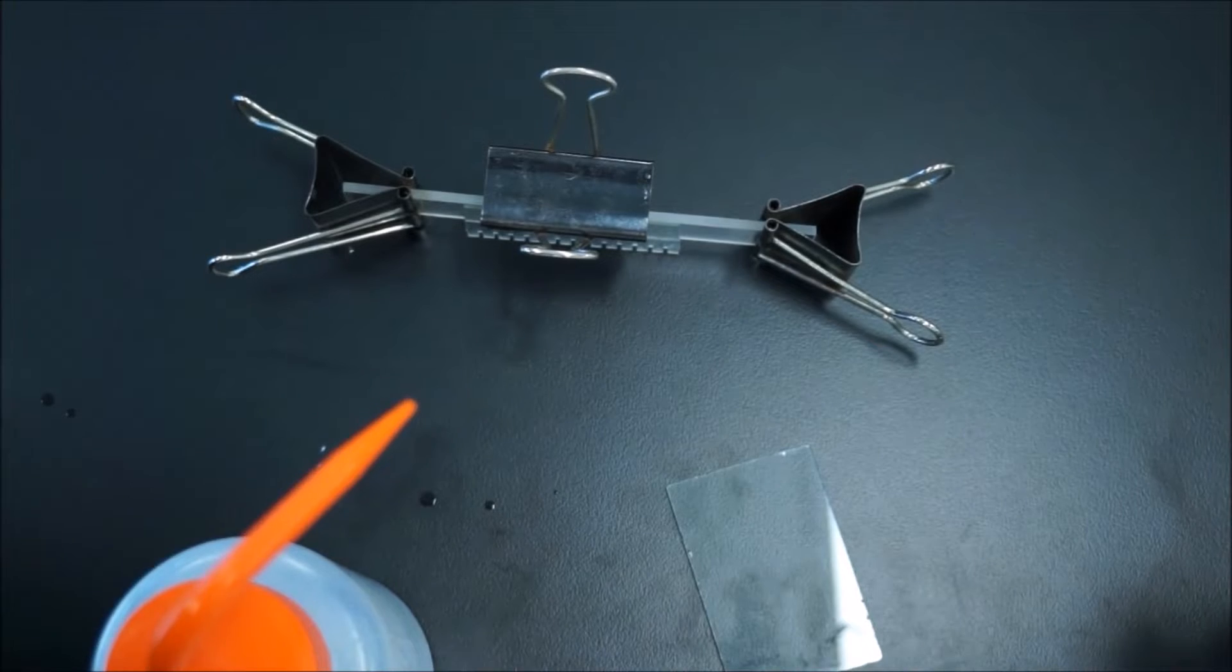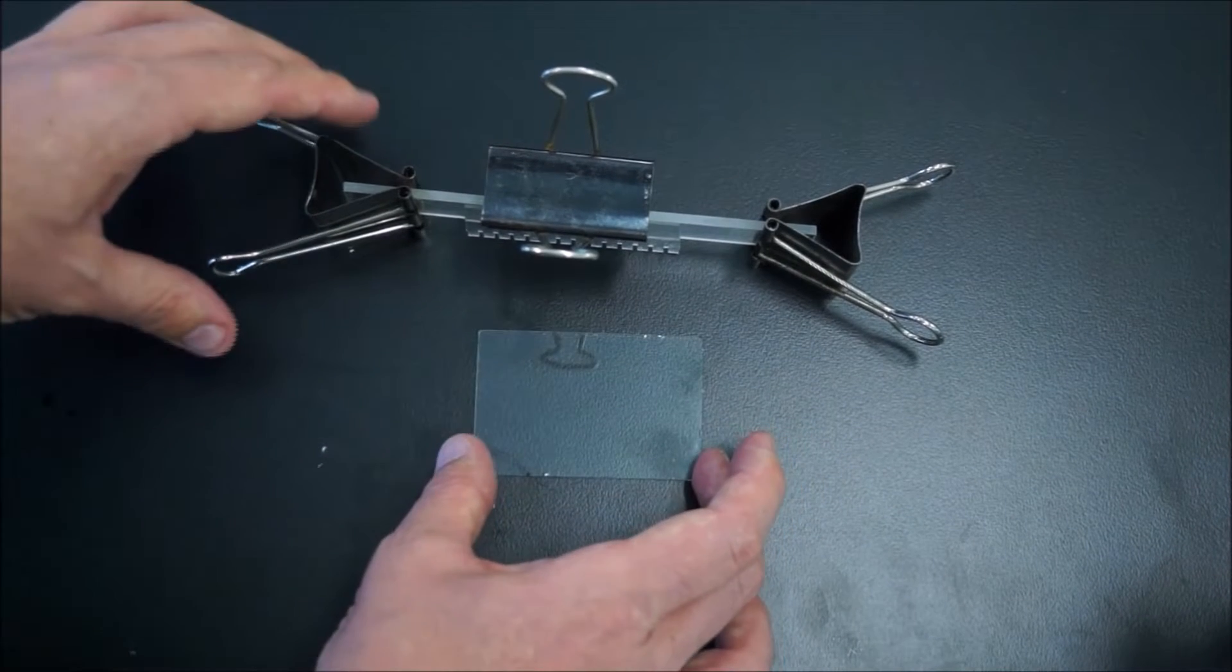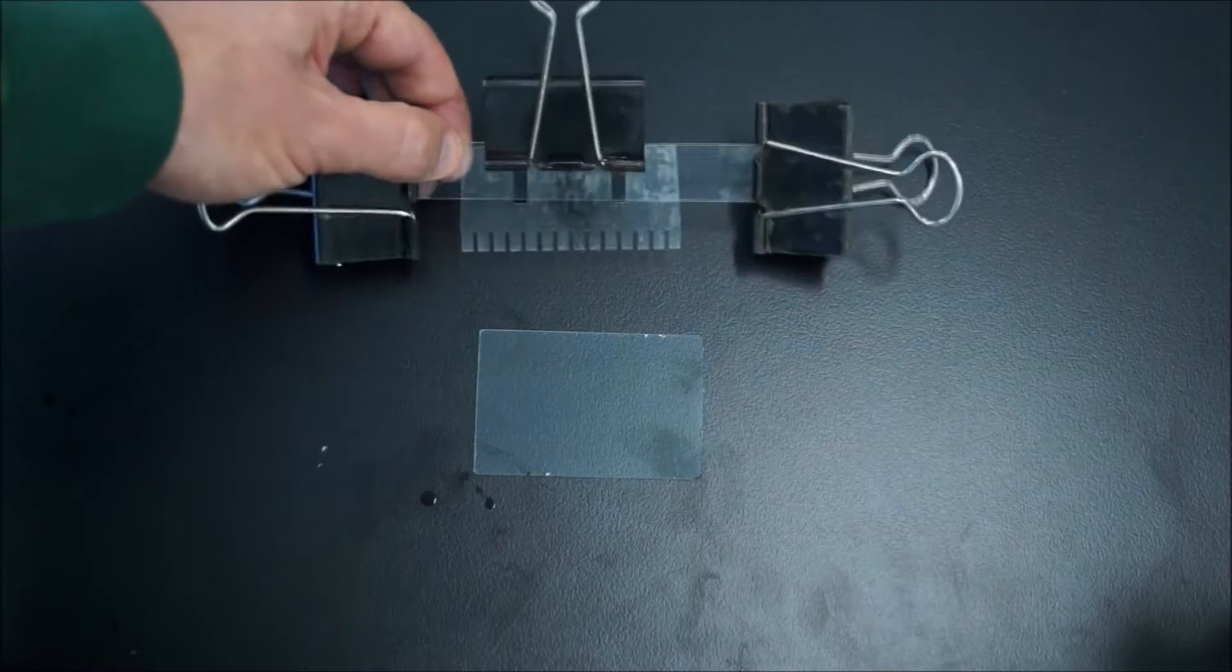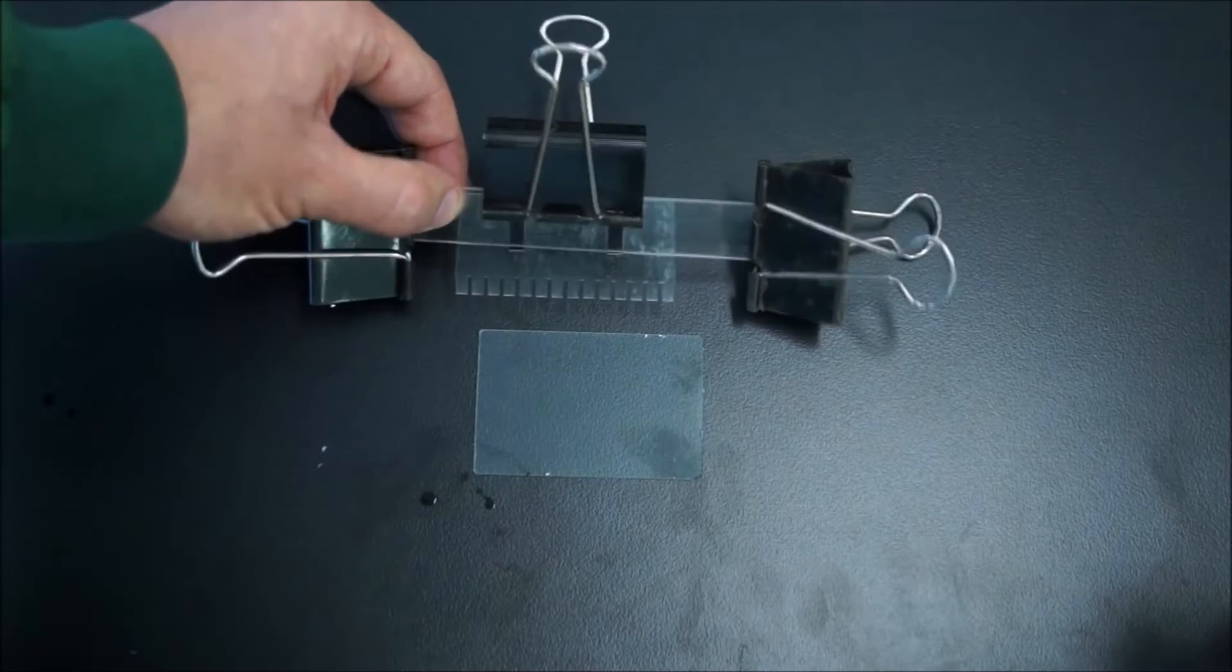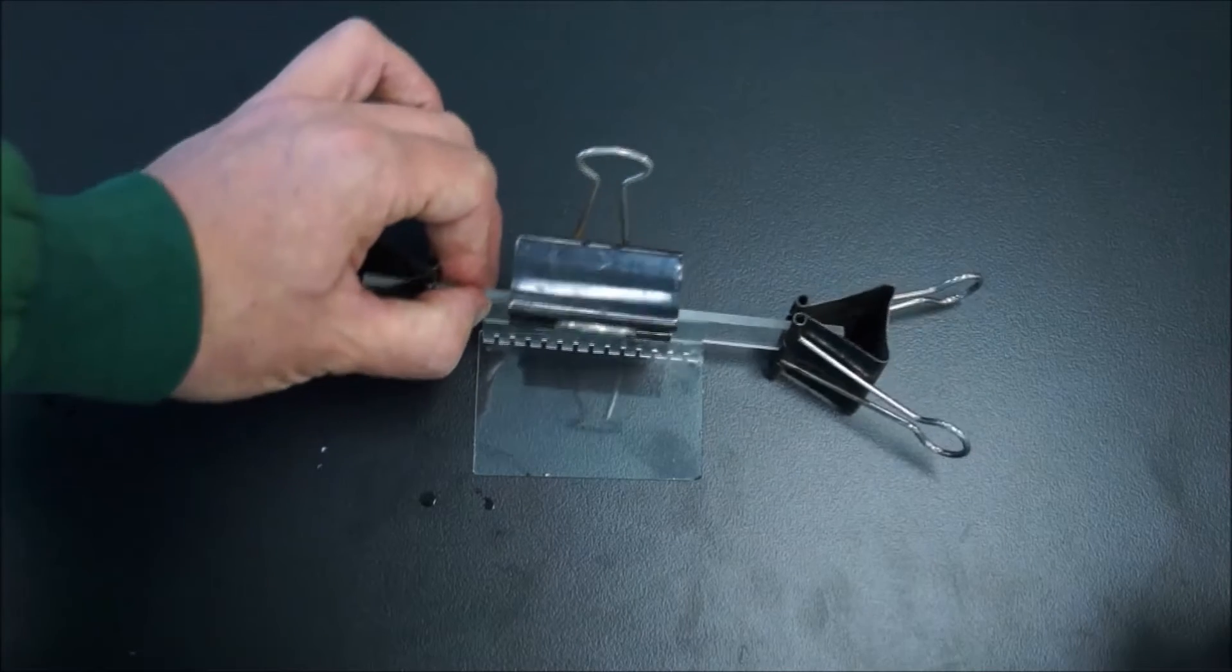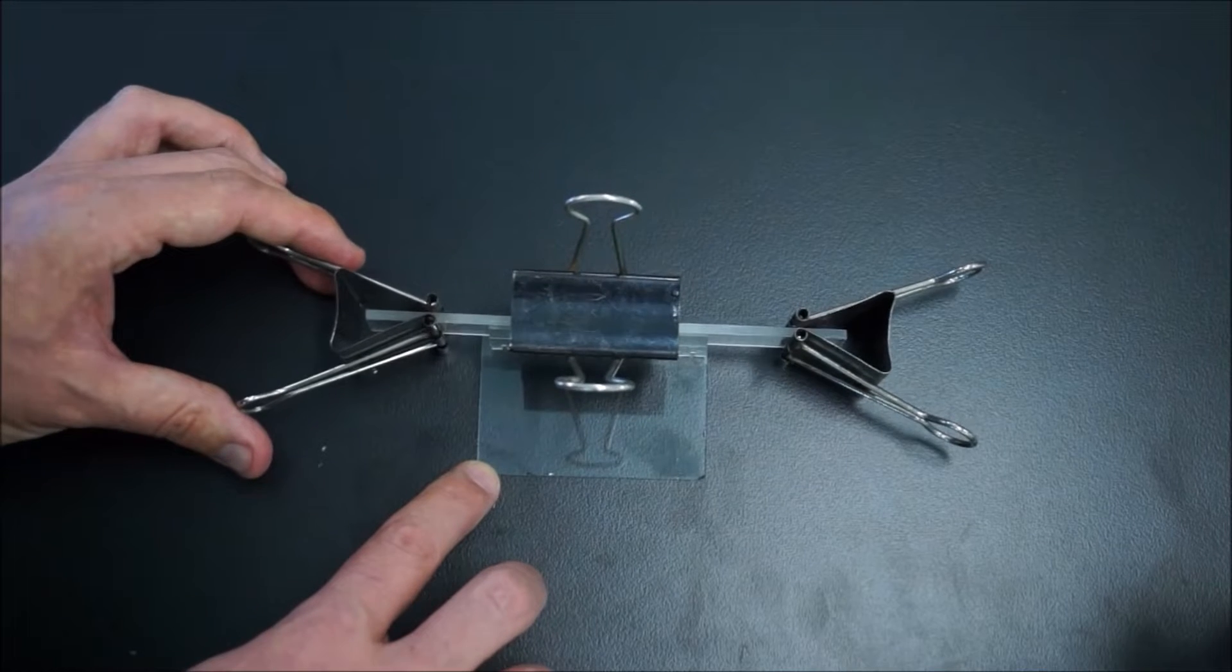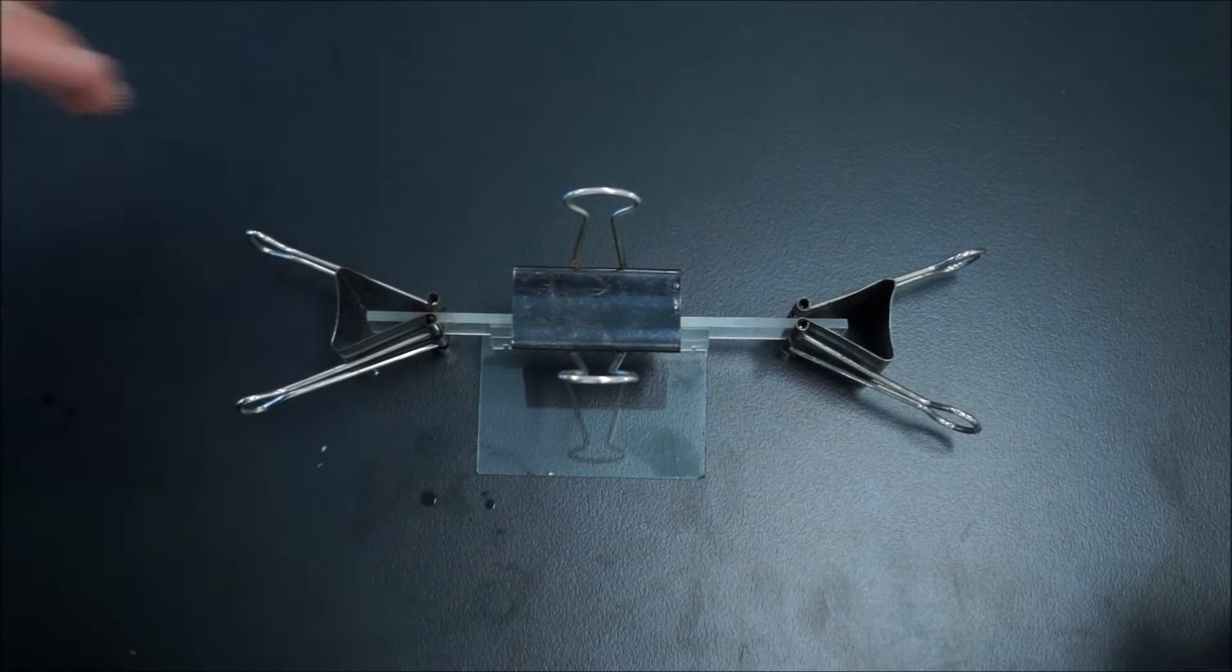Next thing you've got to do is carefully set it up so you can pour the gel. The comb's got to be placed so it makes depressions into the gel as it's setting. I'll show you how it looks from another angle.